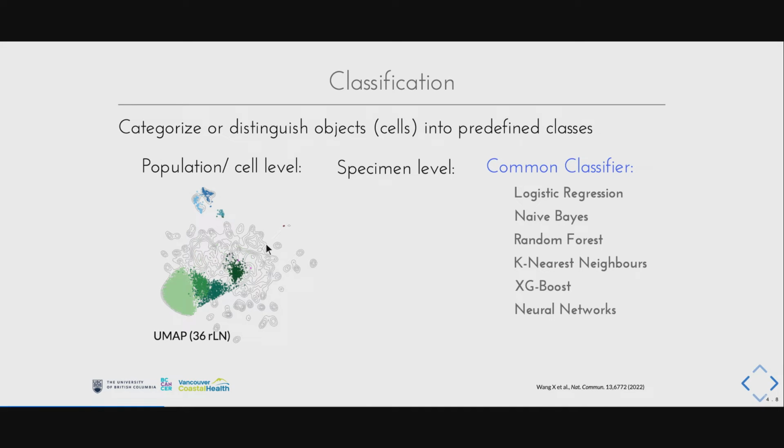But returning to the previous CyTOF example with 38 different parameters, we can train the classification models based on all the markers, and then the classifier can use all the information to identify the cell clusters as different B cell subtypes. Here, we can identify naive B, memory, GC, plasmablast, and plasma cells, based on the 38-dimensional space.